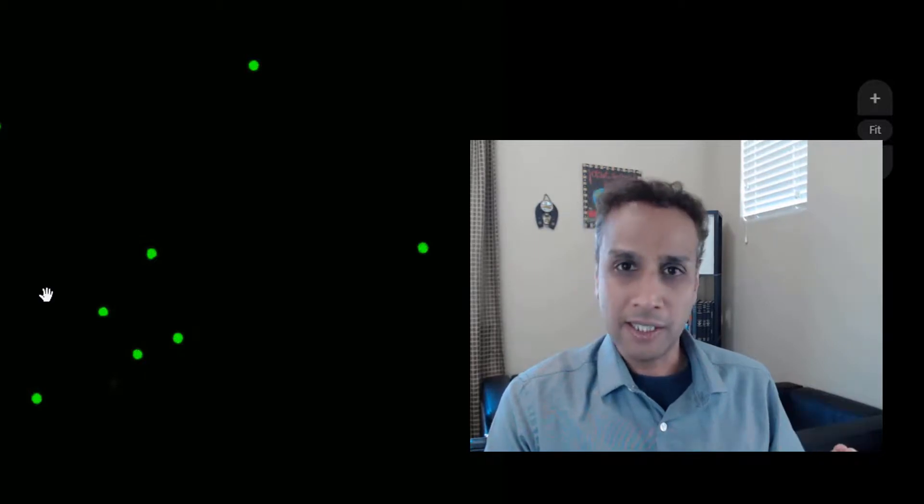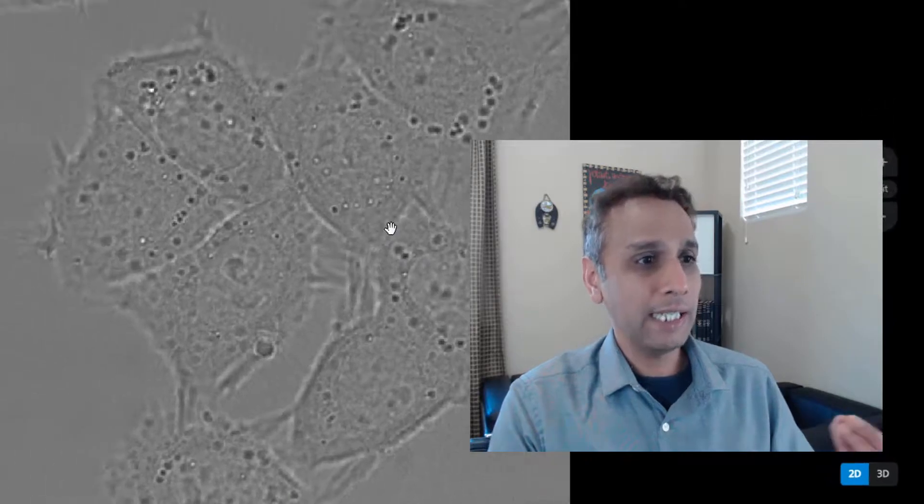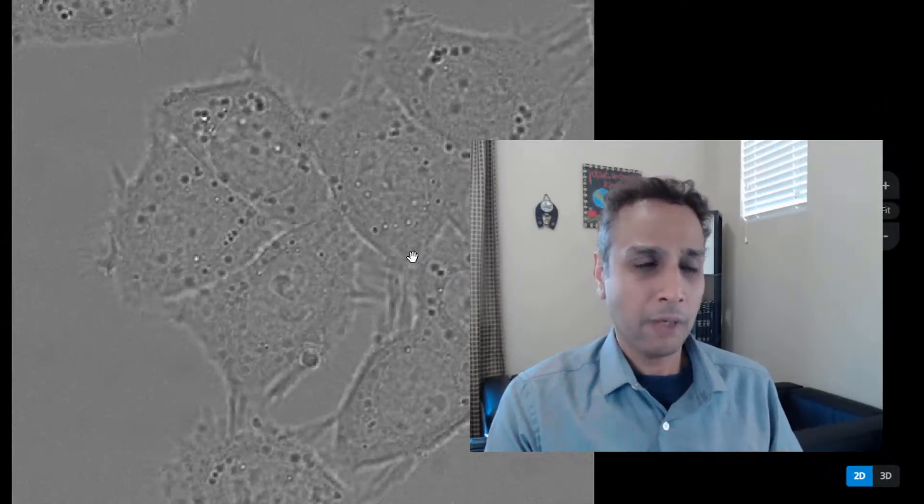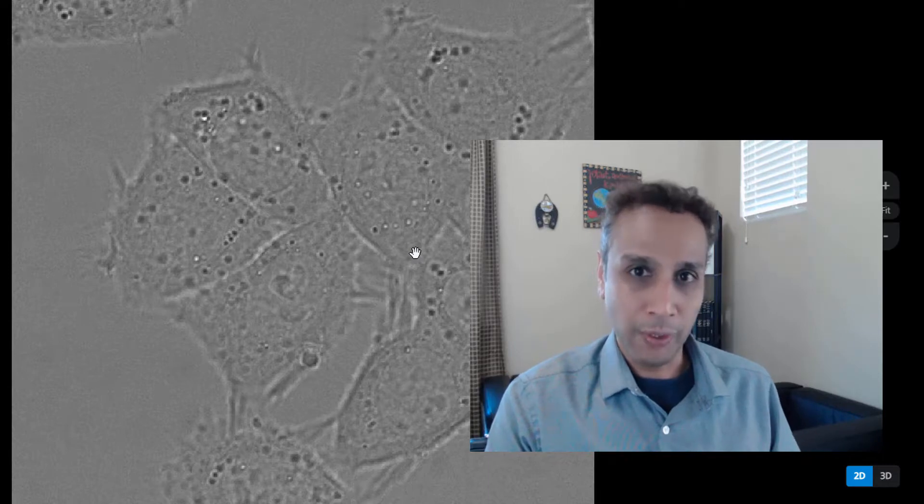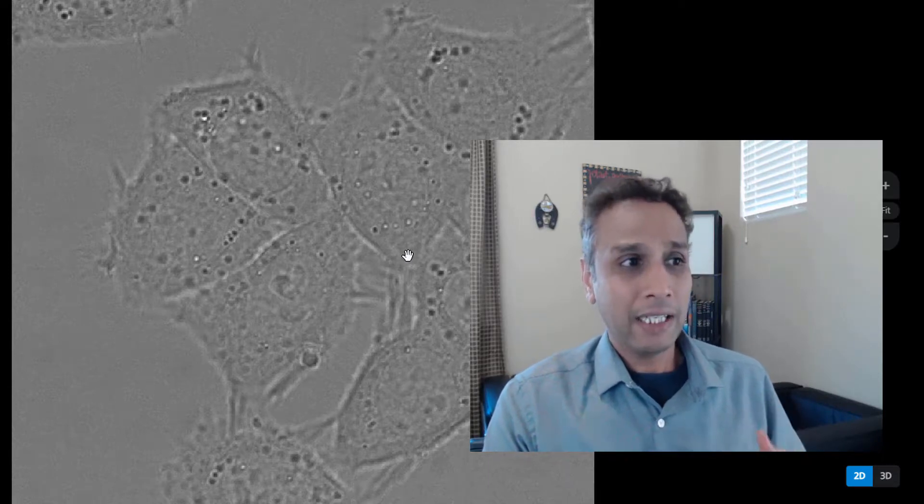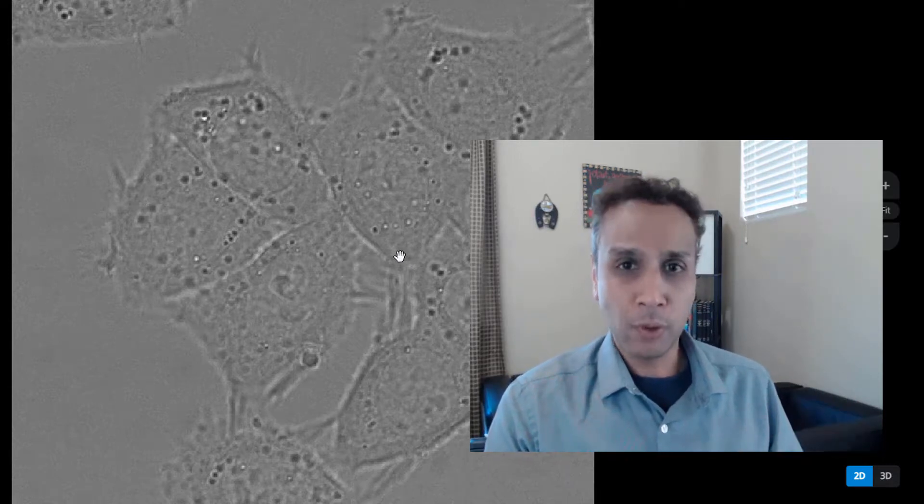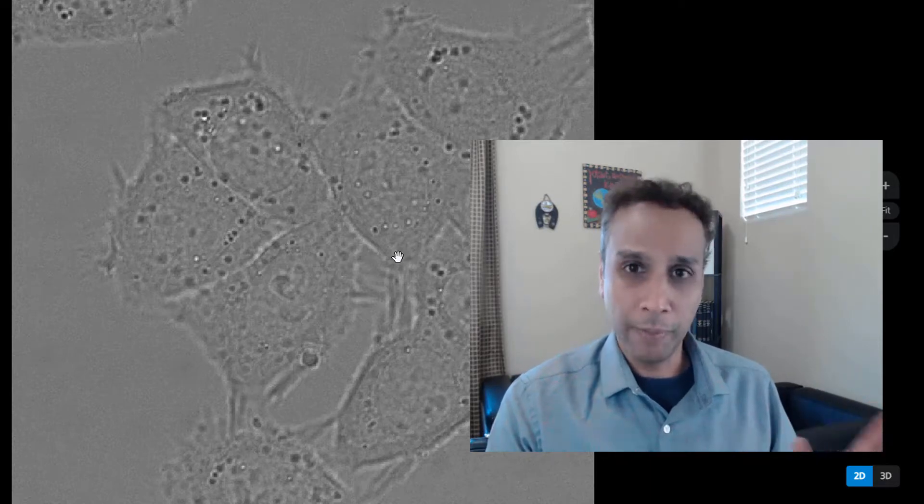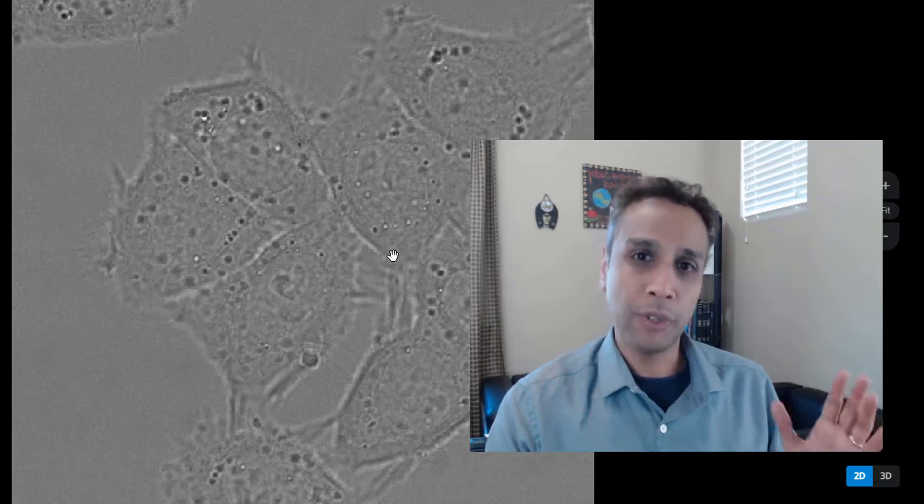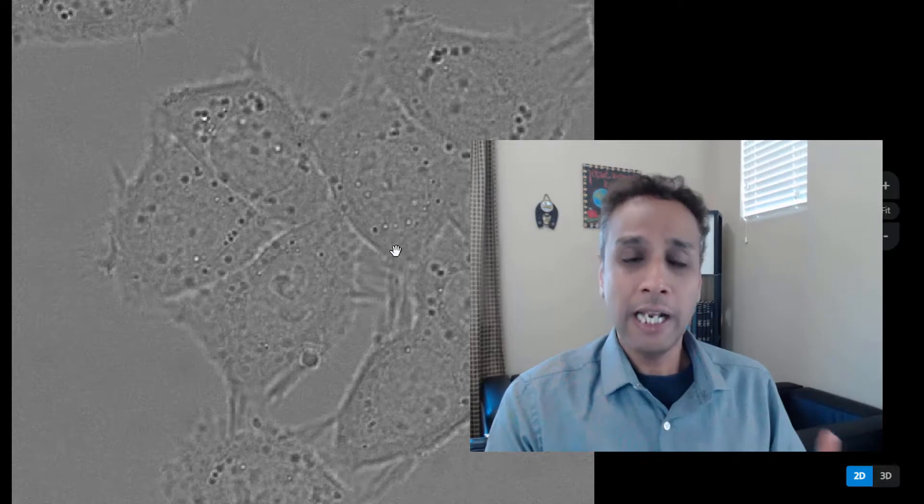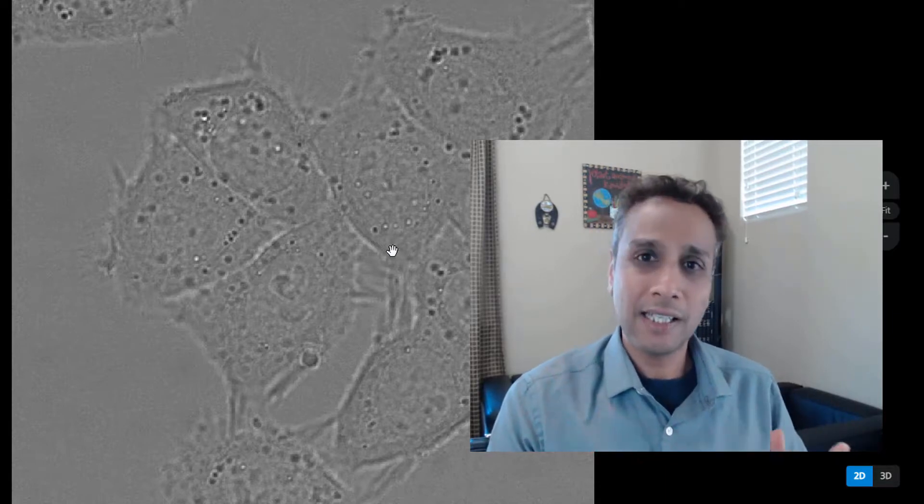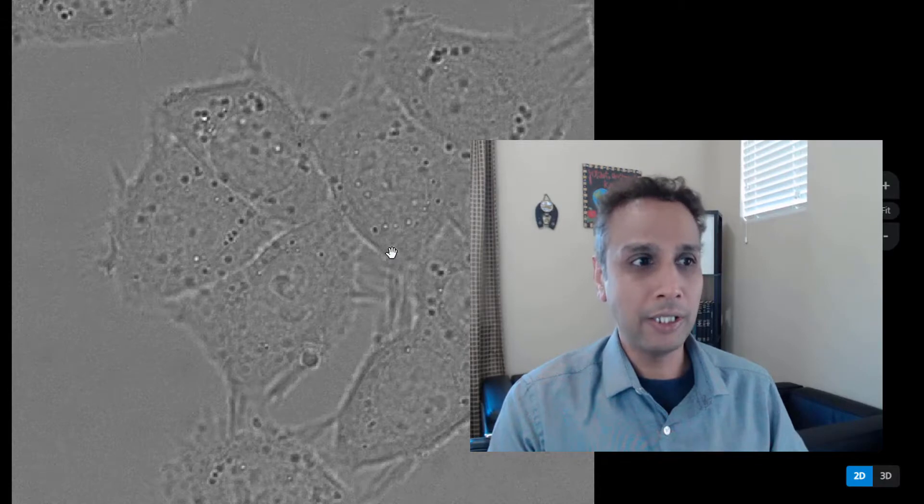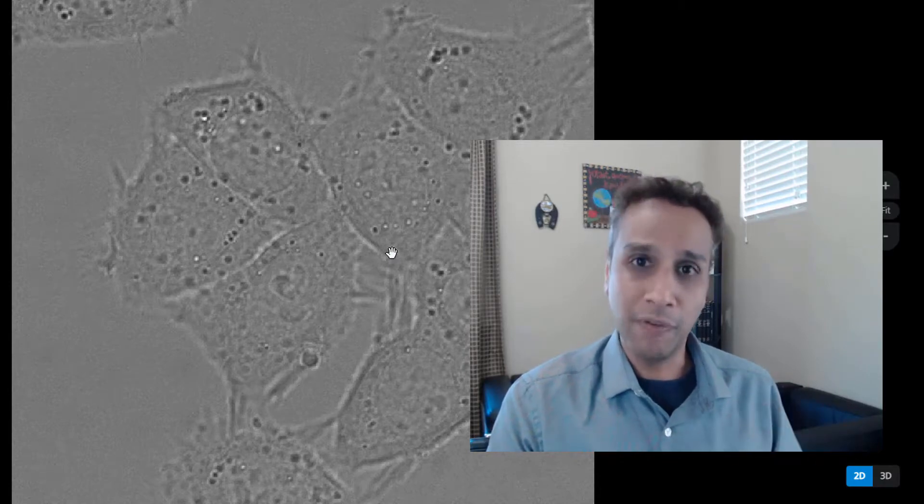Luckily, the segmentation is relatively easy for most images, especially for fluorescence images like the one you see on the screen. We can easily segment this by simple thresholding using, for example, OTSU, and any objects that are close by can be separated using watershed. That segmented image can be provided as input to the tracking module.